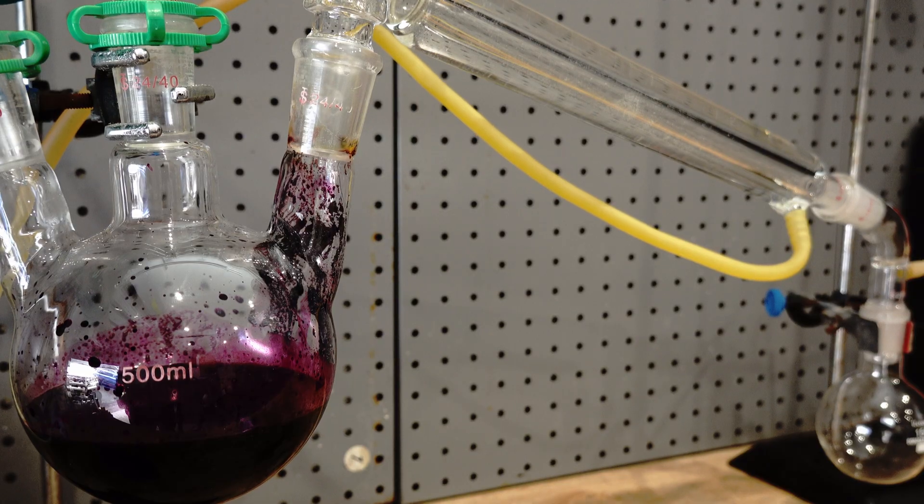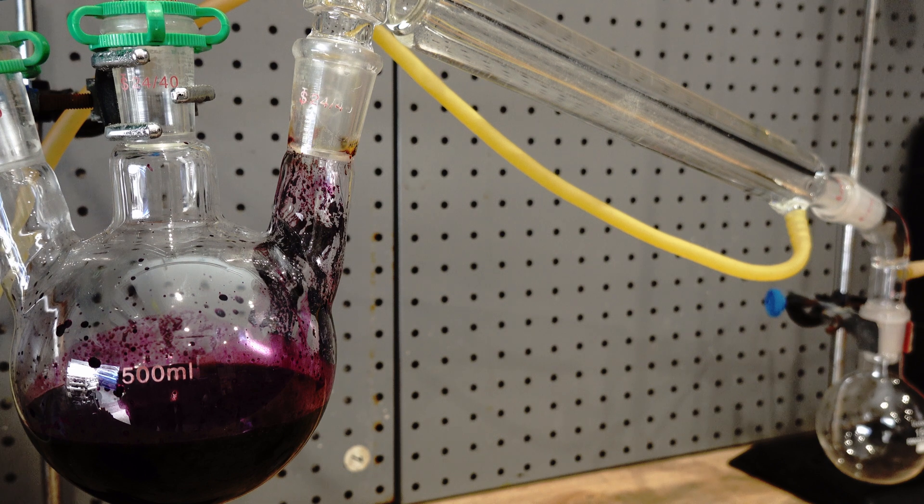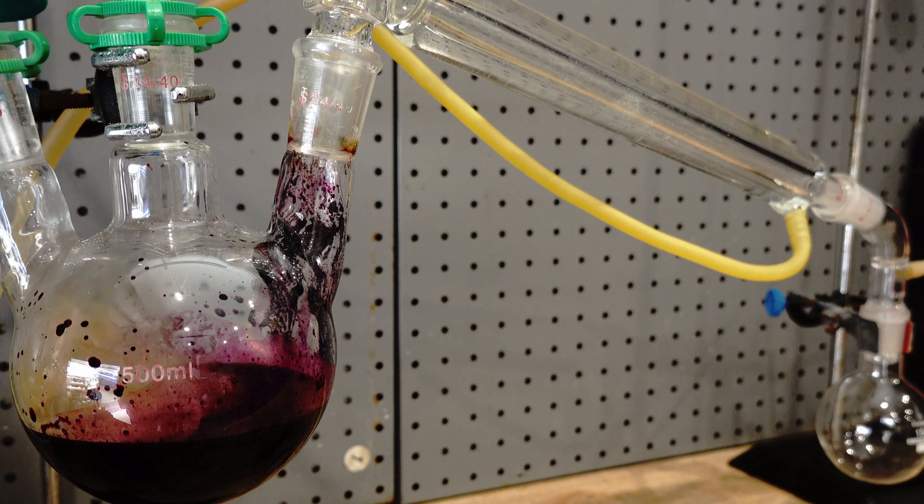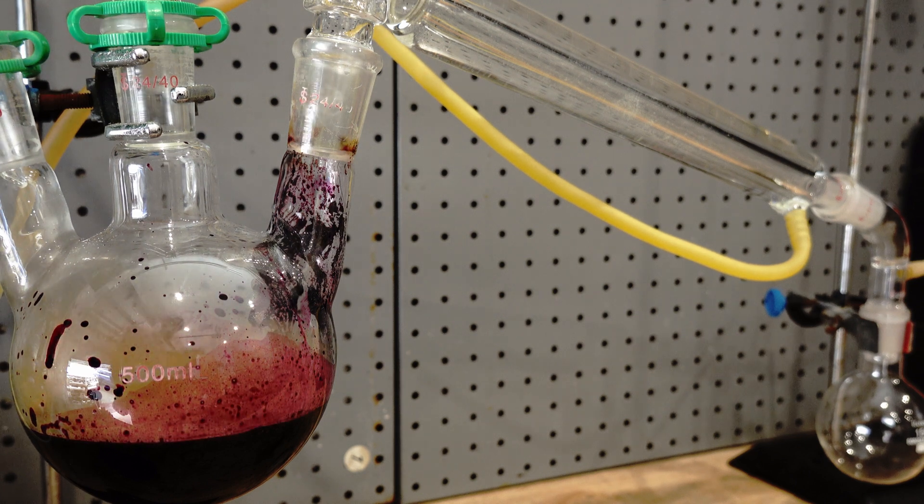I set up a simple distillation apparatus. As the sulphuric acid is added dropwise and the Bromine is generated, it will slowly boil off and recondense into liquid Bromine flowing into our collection flask.